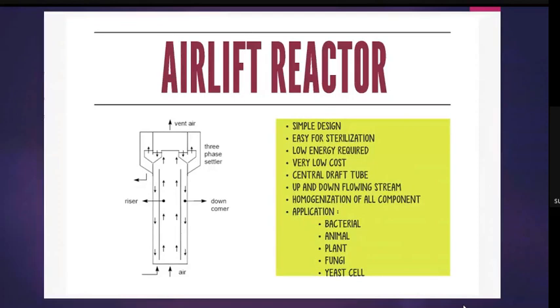Okay, so for mixing purposes we are using this effective mixing, and also the stirrer. That is, if the organism is very sensitive to the stirrer, we use this airlift reactor. So for bacterial, animal, and plant cultures, and for fungi and yeast, they use this airlift reactor.